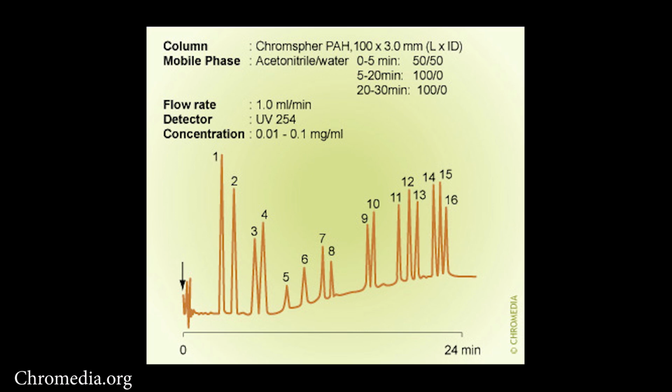So they started at 50% acetonitrile, which is actually kind of a lot, and ramped up to 100% over the course of 15 minutes, gradually from 50% acetonitrile to 100% acetonitrile. And you can actually calculate out what percent B that would be a minute by taking 50% and dividing by 15 minutes. But you can see here, this is beautiful chromatography.